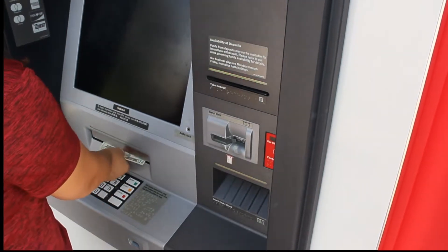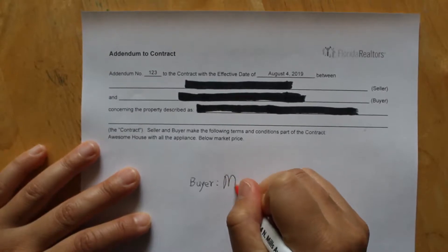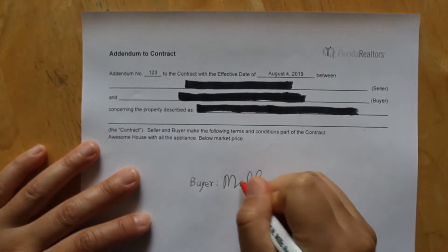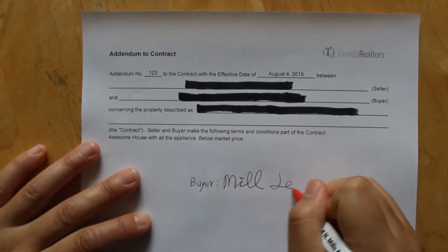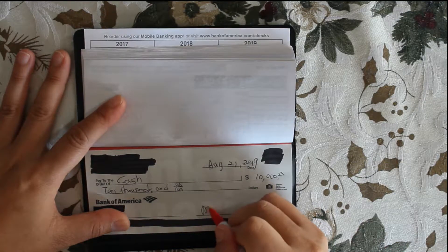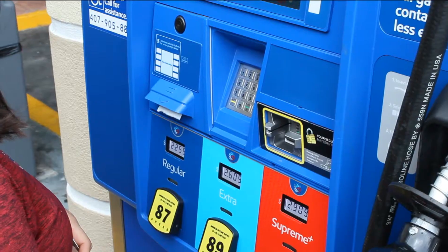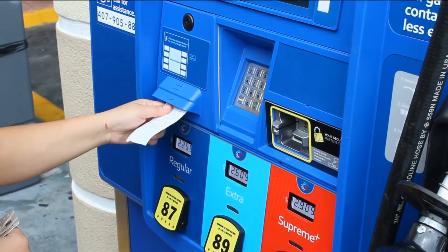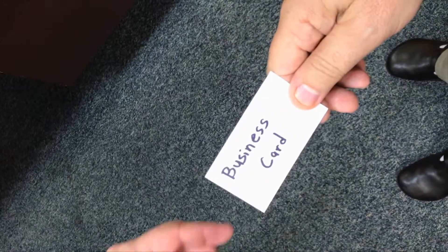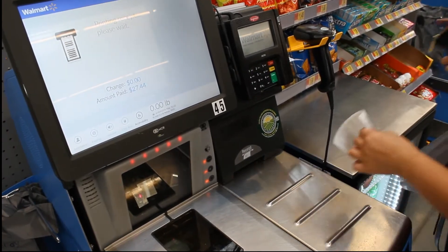Latent fingerprints on paper are everywhere. Latent fingerprints are fingerprints that are unintentionally left behind. They can be very useful in all manner of investigations. Lifting latent fingerprints means making them visible so they can be recorded. This video will show it's possible to lift latent fingerprints from porous paper using only light and an ordinary camera.